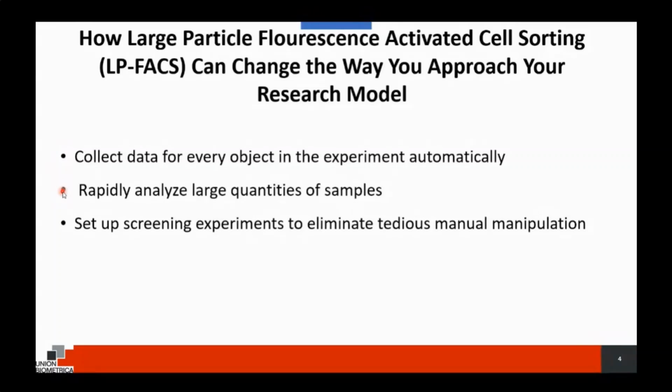It allows for rapid analysis of large quantities of sample, and you can set up screening experiments in a way that's efficient and more time efficient than manual manipulation.